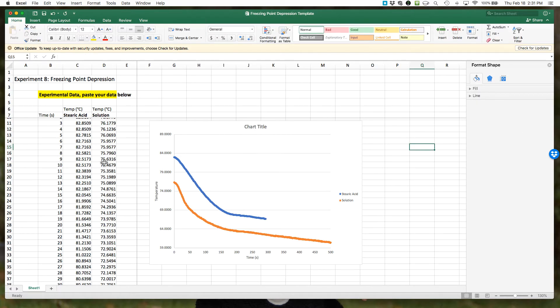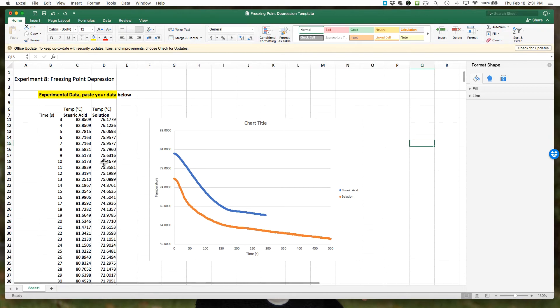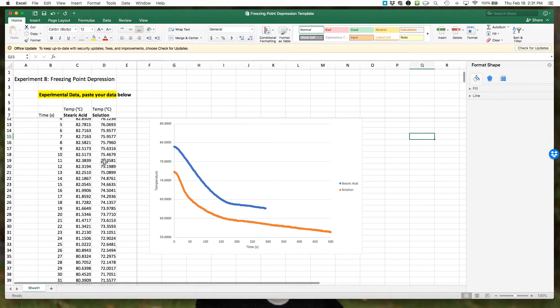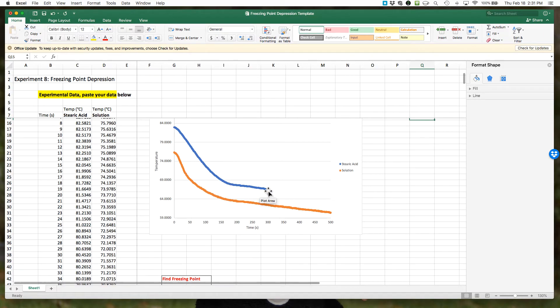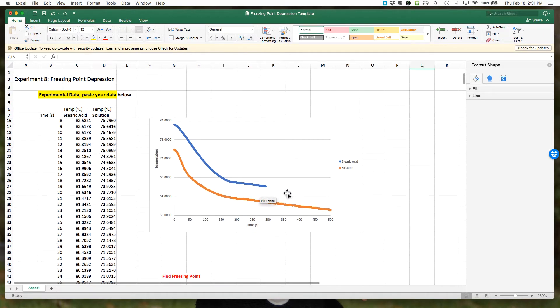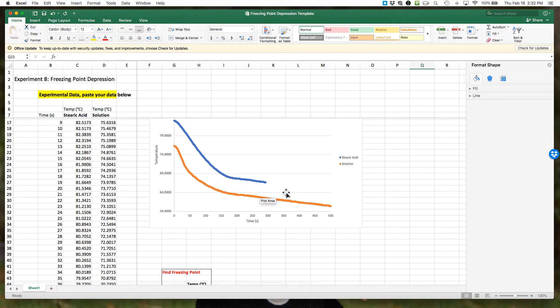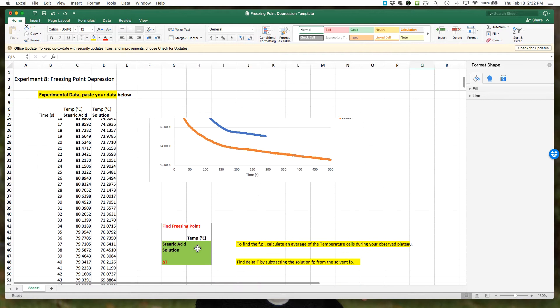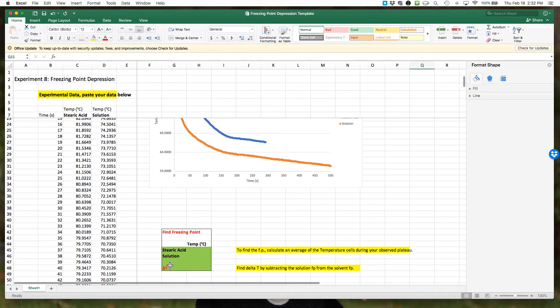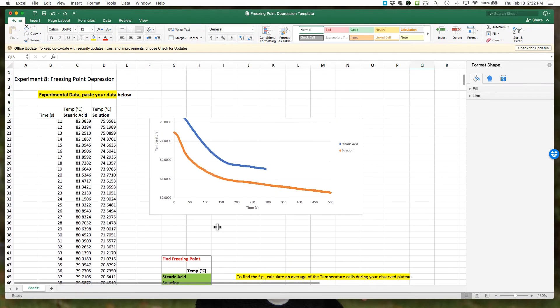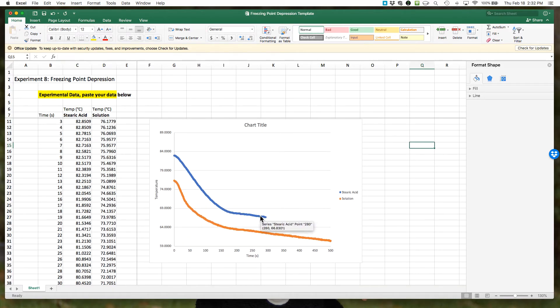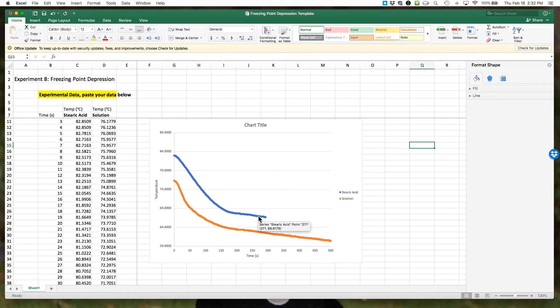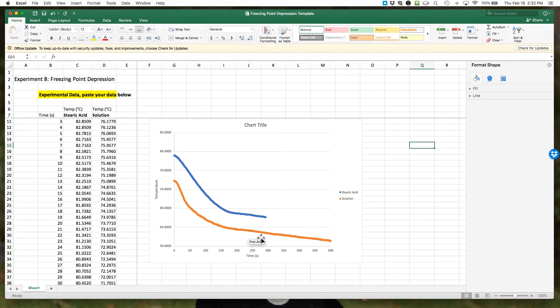What we now want to do is use the plot to find our freezing points. We want the average temperature of our plateaus, and we're going to do that in this green box here. The way we're going to do that is, first come up to your plot and say, all right, we can start to see where these temperature plateaus are. For the steric acid, I might think, okay, where is that plateau?